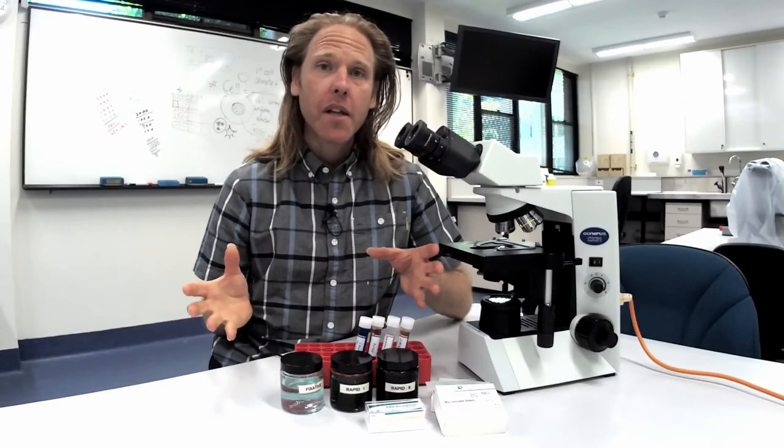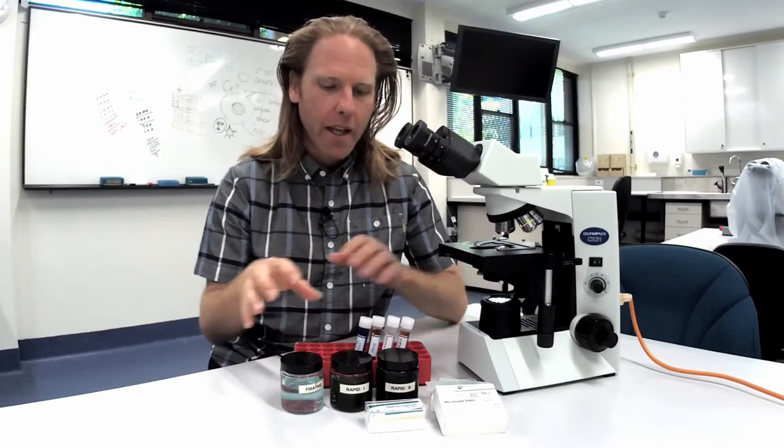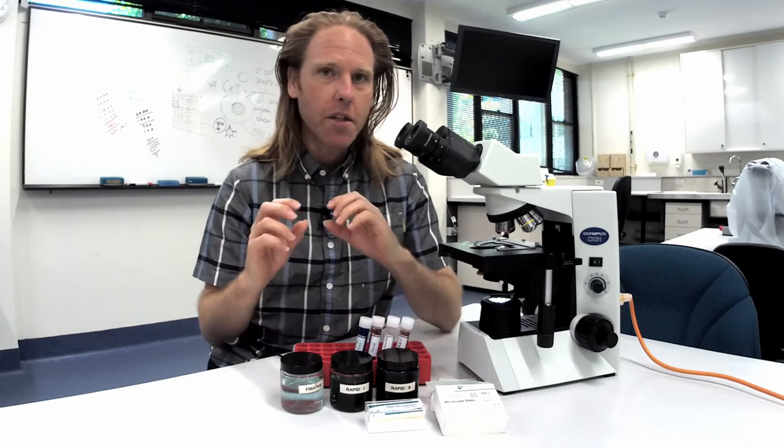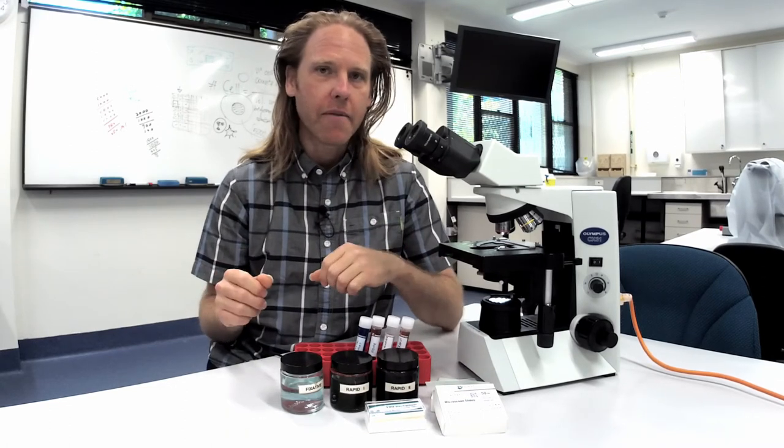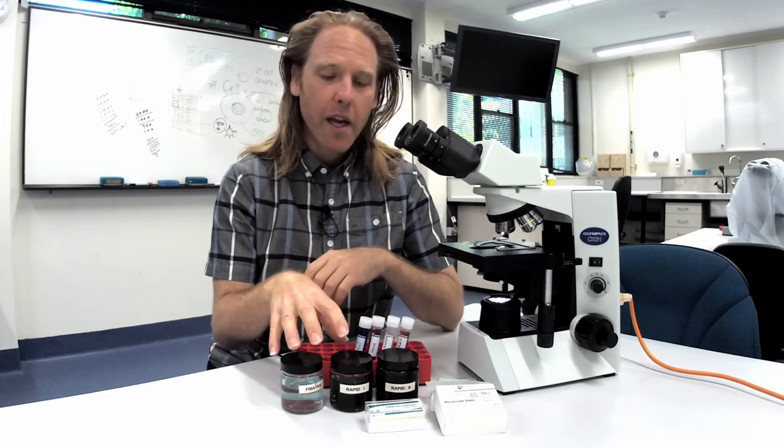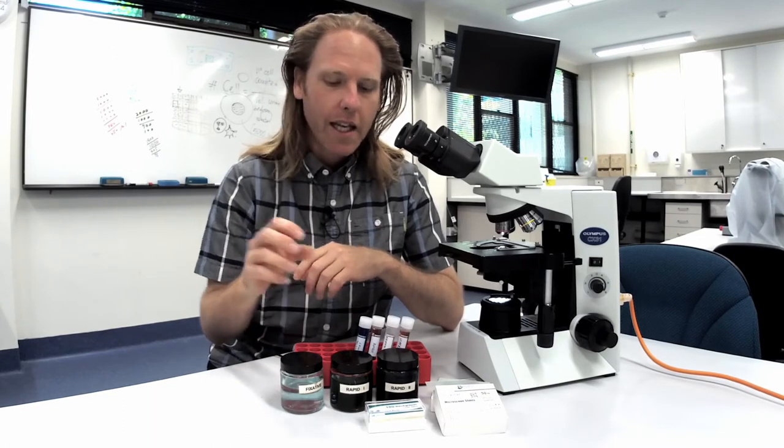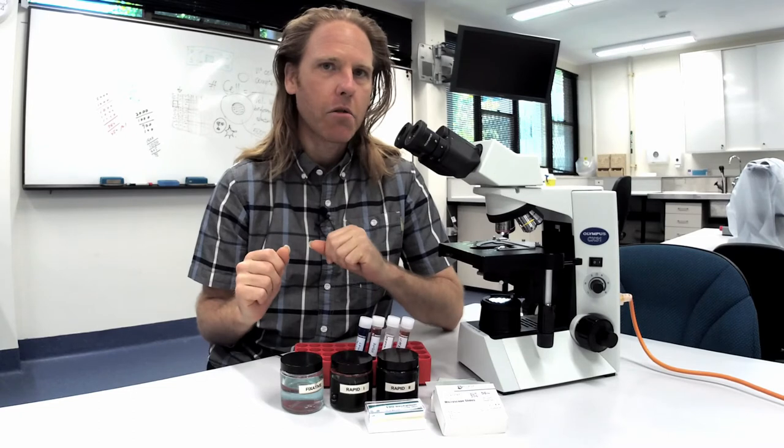The two main stains we use in the hospital are Difquik and Gram. Difquik is excellent because it shows cell morphology really well. It's quick and easy and it's cost effective. Now you need to be aware that with Difquik the stains need to be changed regularly and it may not show up mast cell granules all that well.